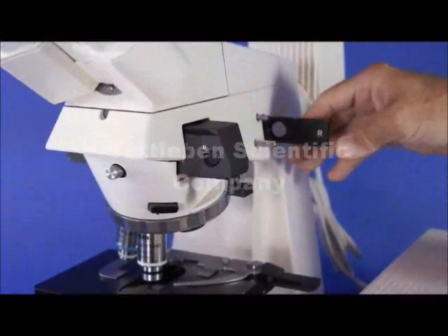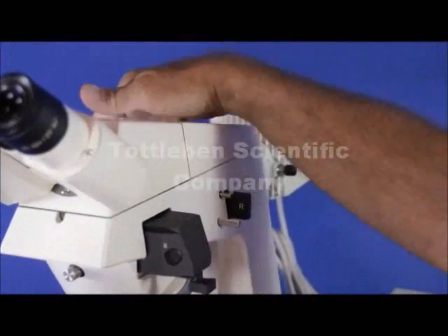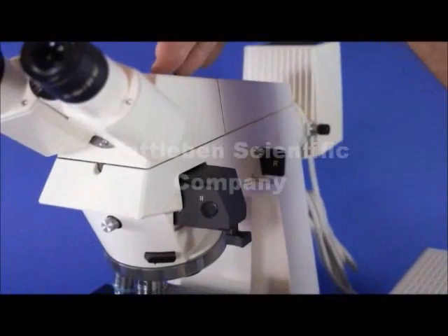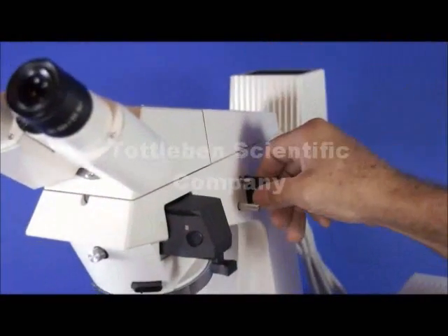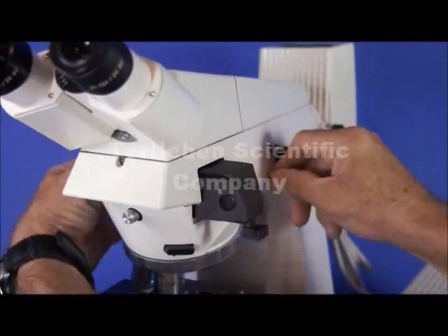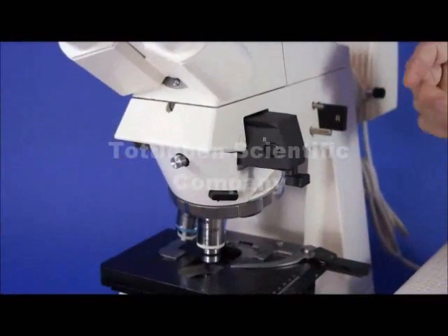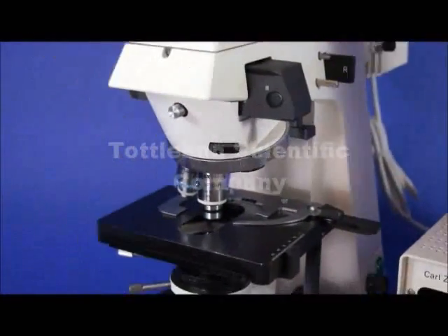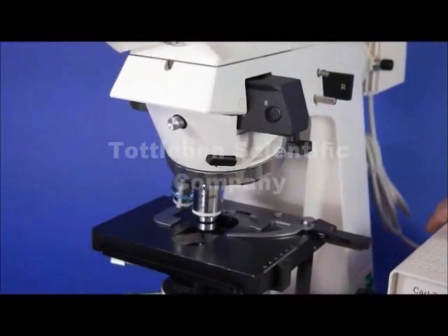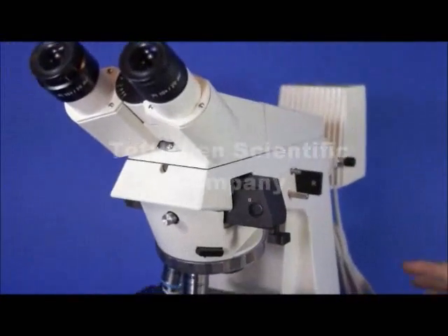There's a filter stop here so that you can prevent light from coming through while you're doing brightfield and it won't interfere with specimen quality. You've got centering mechanisms for centering the field diaphragm for the vertical illuminator. Everything on this microscope works beautifully — it's in tip-top shape and you'd be very pleased with this microscope.